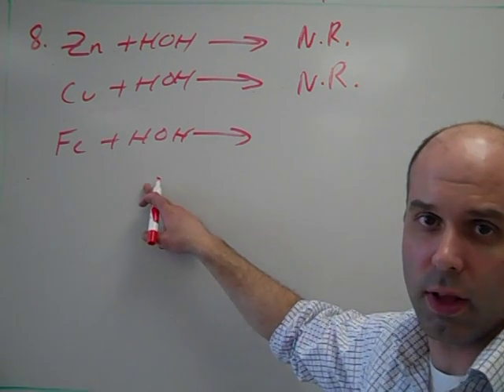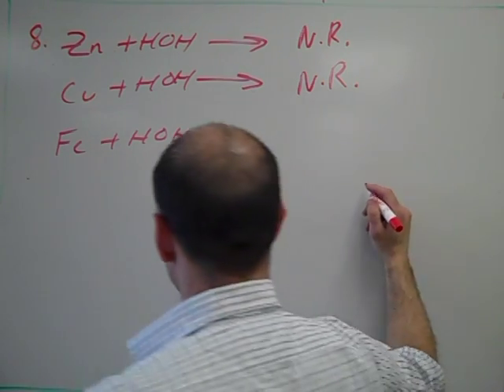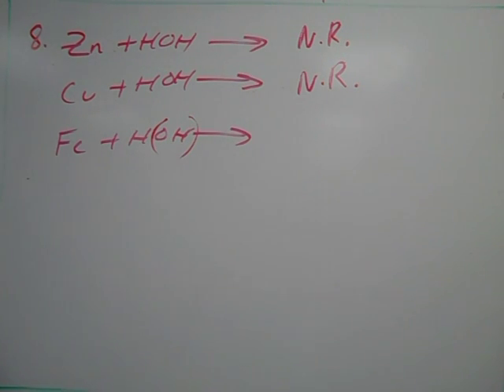Iron does rust. If you look very closely, you would have seen tiny little bubbles, and the bubbles forming would have been hydrogen bubbles. It doesn't matter if you pick it to be iron 2 or iron 3. You should be able to balance the reaction either way.